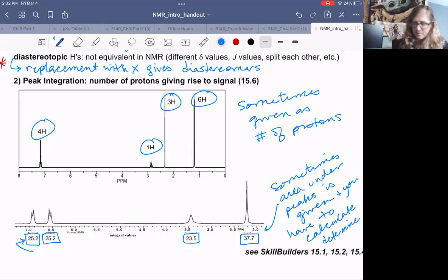Okay, so when we take a quick look here, you know, 24, 24, 24, and 36, that would be like if one hydrogen was around 12 units of area, then we would see that the ratio here is that this is 2, and this is 2, and this is 2, and this is 3. Right, this number is 50% bigger than the others.